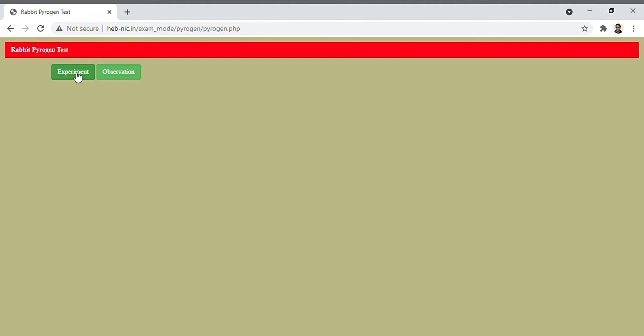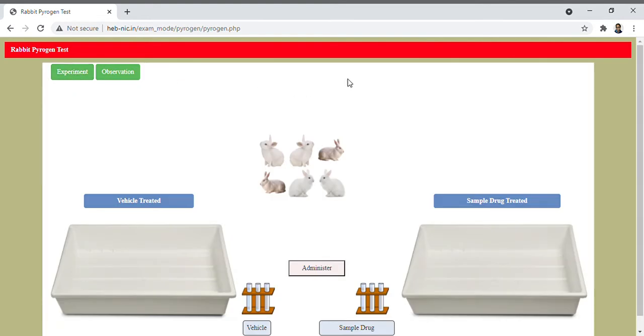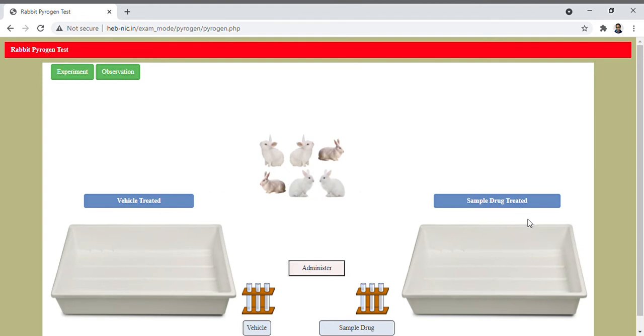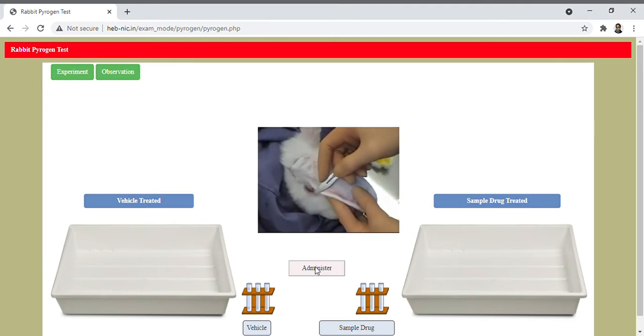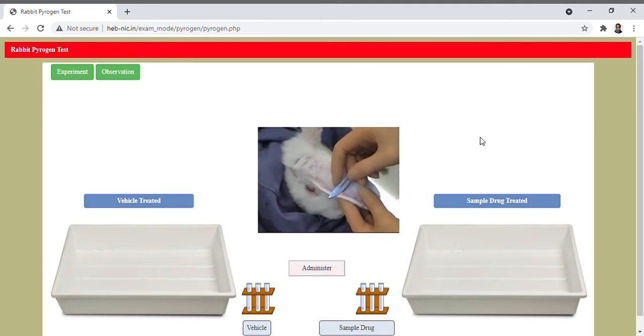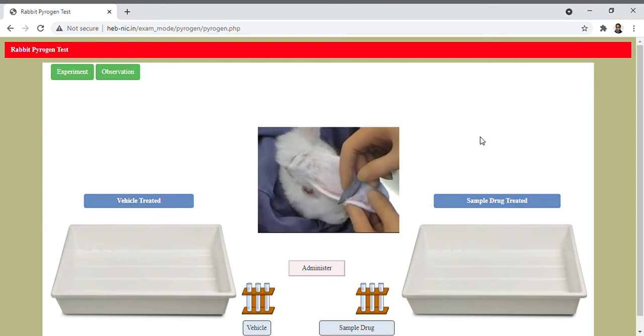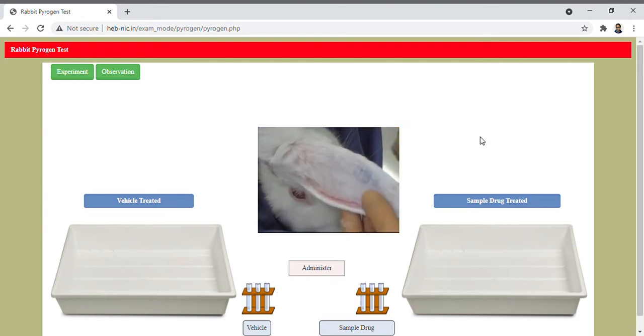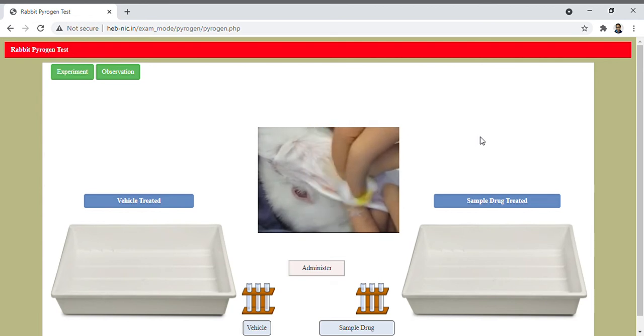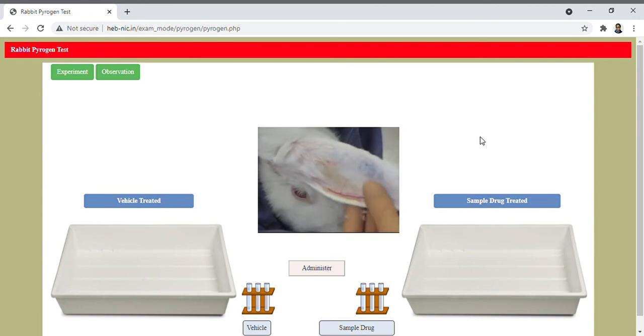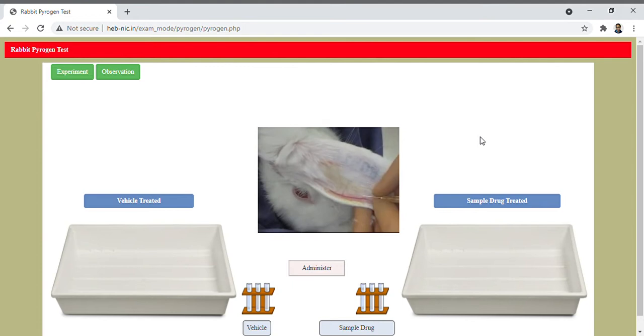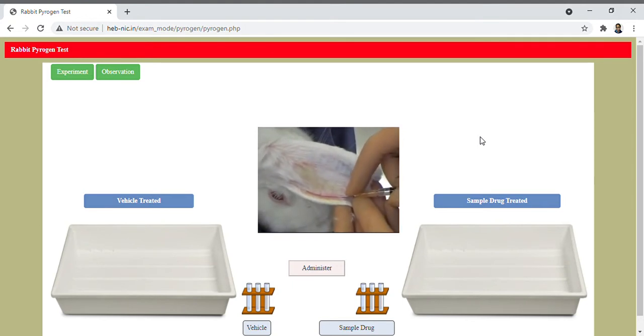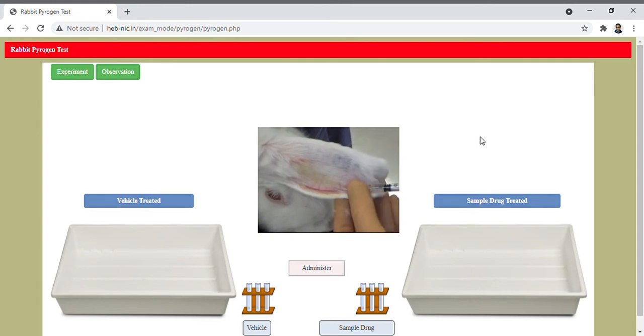We require rabbits, so here we have taken three for the vehicle treated group and three for the sample drug treated group. We administer the test solution vehicle first, so see how to administer saline and test solution to sample drug treated rabbits.